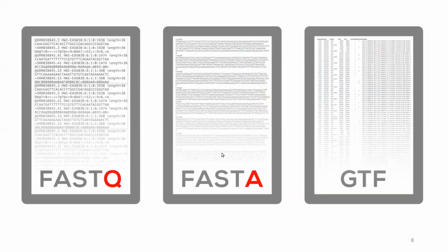Okay, so let us go into how we have generated the data that we are going to look at. So we have a FASTQ file. What does a FASTQ file have? A FASTQ file has the sequence. As you can see, it has the length. For example, the length of this sequence is 36. These are short reads, and they also have quality scores. These are the quality scores of this particular read, so starting from here up till here is the entire description of this particular read. It tells you about the length, the actual sequence, and also the score or the quality of that particular sequence.